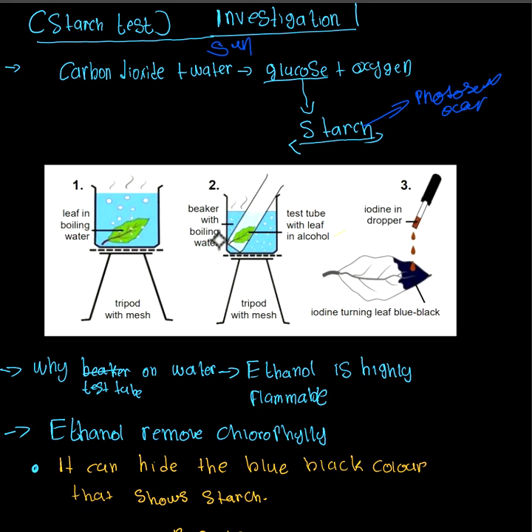Secondly, we take the test tube and we place this leaf inside the test tube, and this test tube has alcohol within it, particularly ethanol. This test tube, we don't place it directly to the fire. We must make sure that we place it within this boiling water, or the water bath.